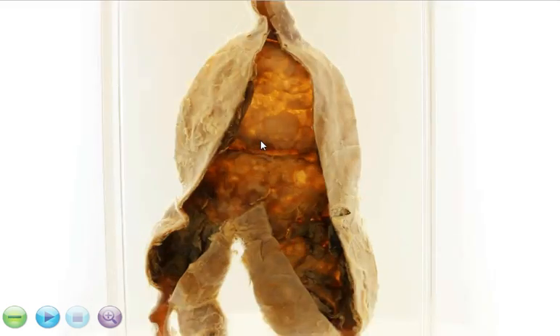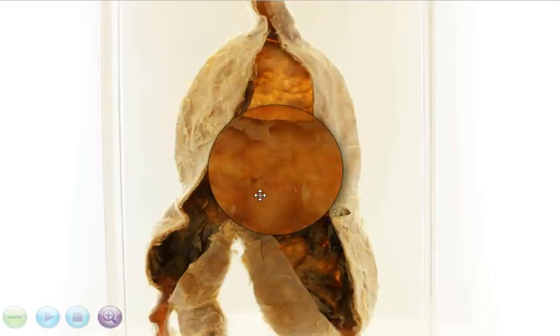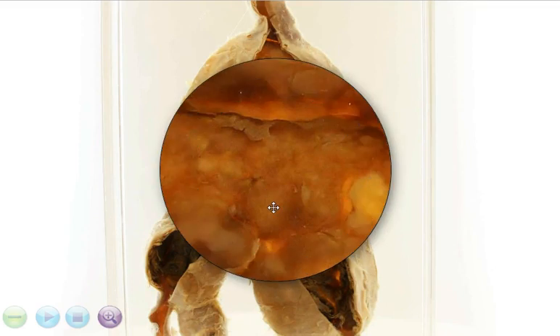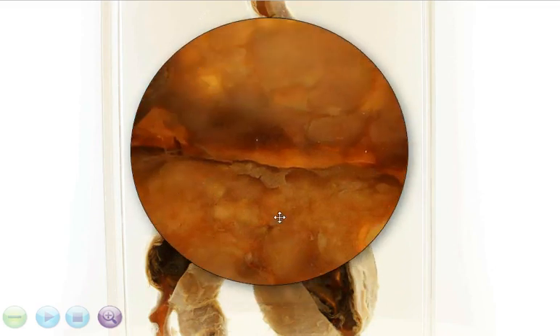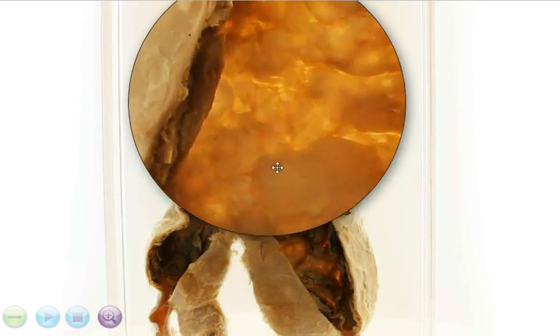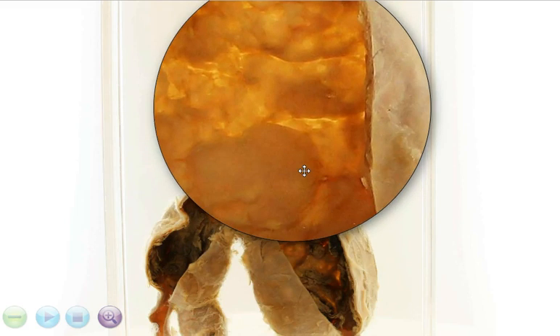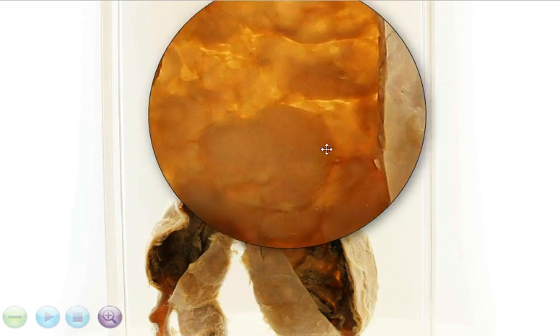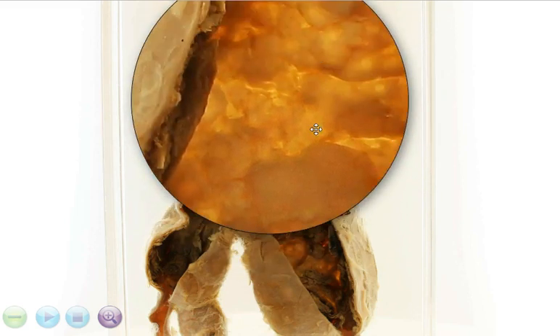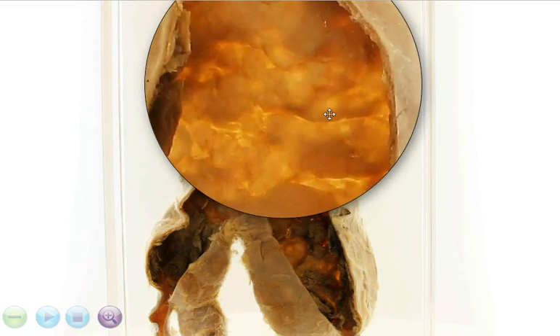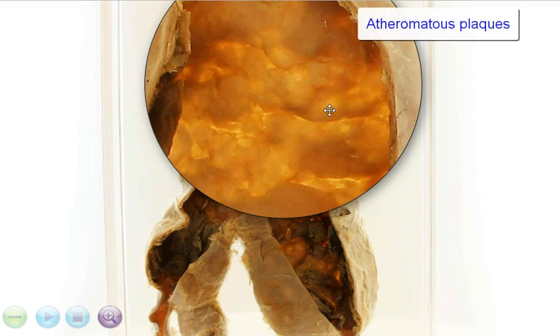And if you look carefully at the area of dilatation — I'm just going to magnify this area — you can see that there are these yellowish deposits beneath the endothelium, and these are atheromatous plaques.